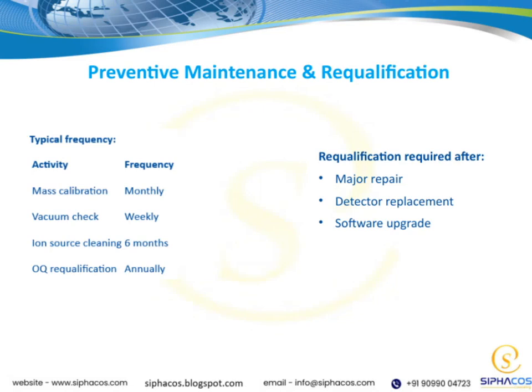Now, let's talk about when requalification is actually required. Essentially, after any major repair or detector replacement, it's important to perform requalification to ensure everything is still functioning correctly and safely. The same applies after a software upgrade, as updates can sometimes affect system performance or calibration. Additionally, even during routine preventive maintenance, requalification should be considered to maintain optimal operation. Remember, these steps are crucial to keep the system reliable and compliant with safety standards, which ties back to our overall goal of ensuring consistent quality and safety in our processes.